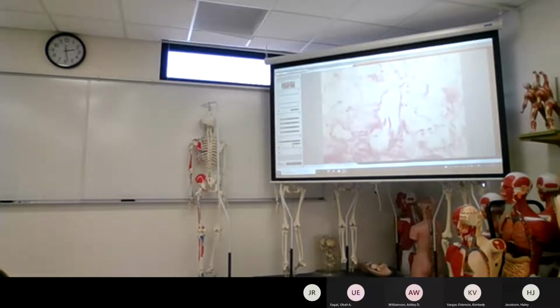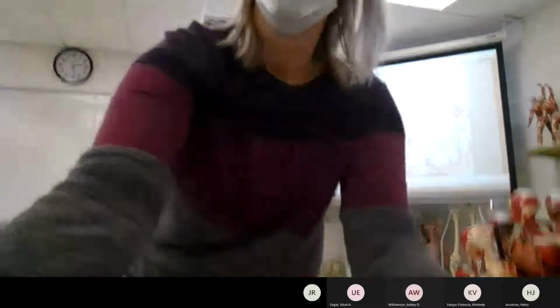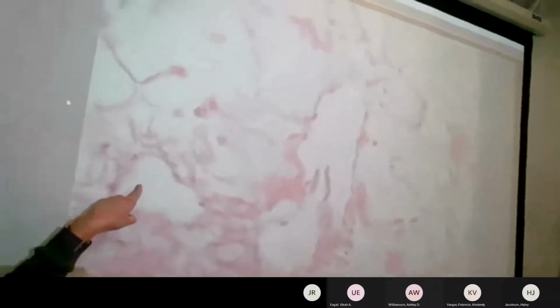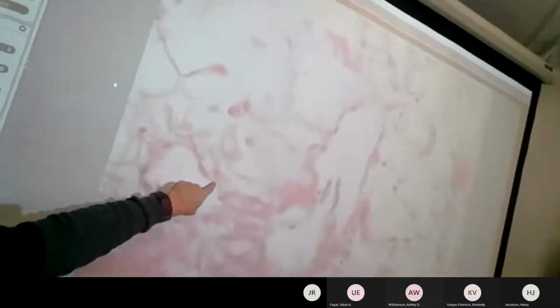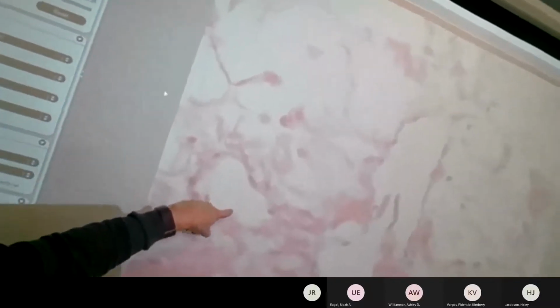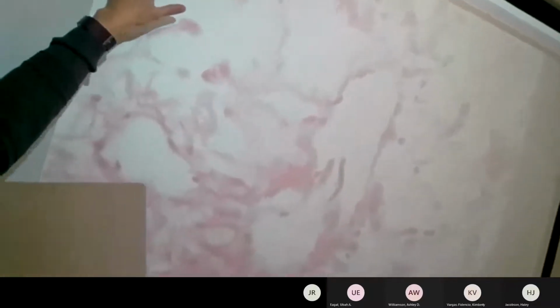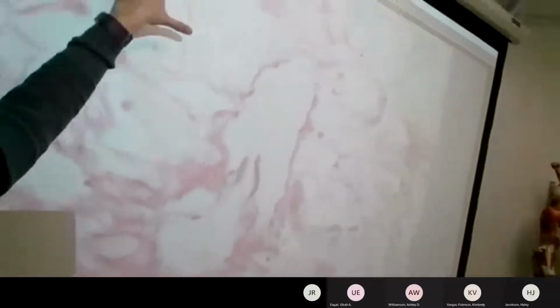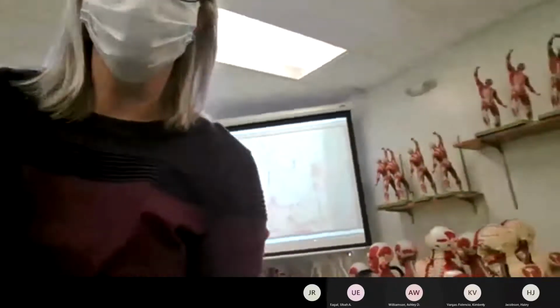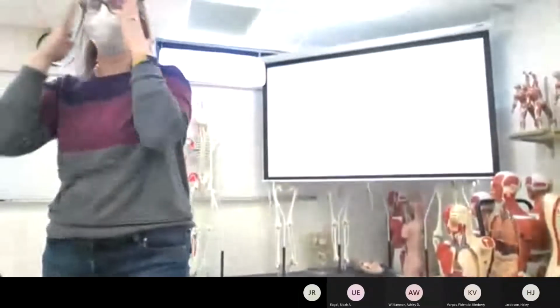Okay, so in this image, here's a blood vessel right here, and if you look at it, there's one squamous cell, there's another simple squamous cell, so you can see some of the endothelial cells here. Out here, there's these open spaces. Those are some of your fat cells, and every now and then there'll be some material that collects in the corners of where some of the fat cells are together. Okay, but those fat cells represent your adipose tissue.